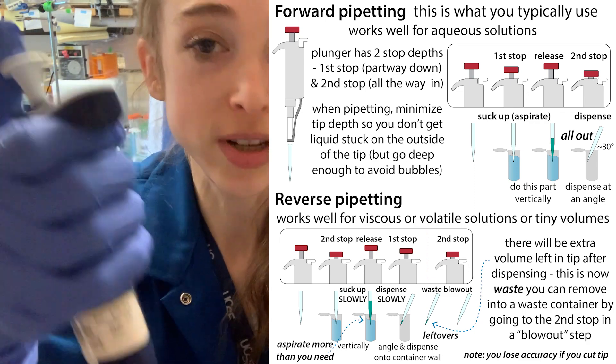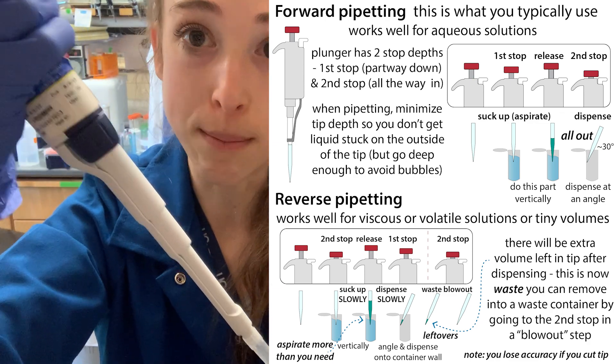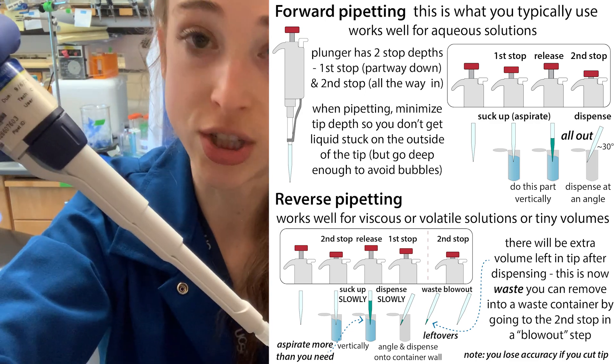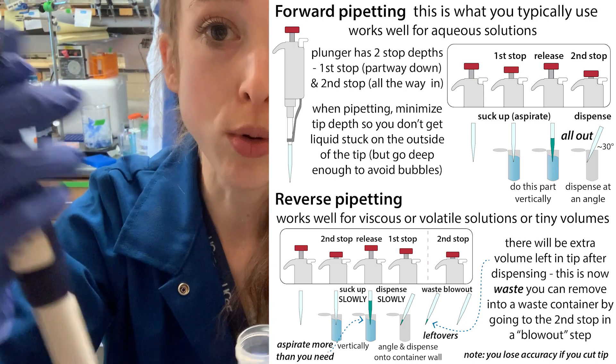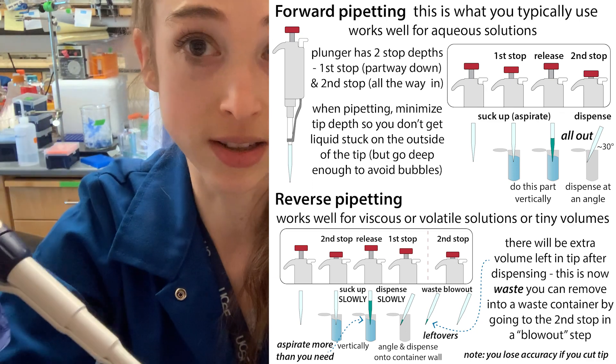With normal pipetting, you go down to the first stop with your thumb, go into the liquid, pull up, and pull out. Then to dispense, you go into the liquid and push down all the way to the full second stop, hold down your thumb, and pull out. So you aspirate and then dispense all of the liquid you sucked up.